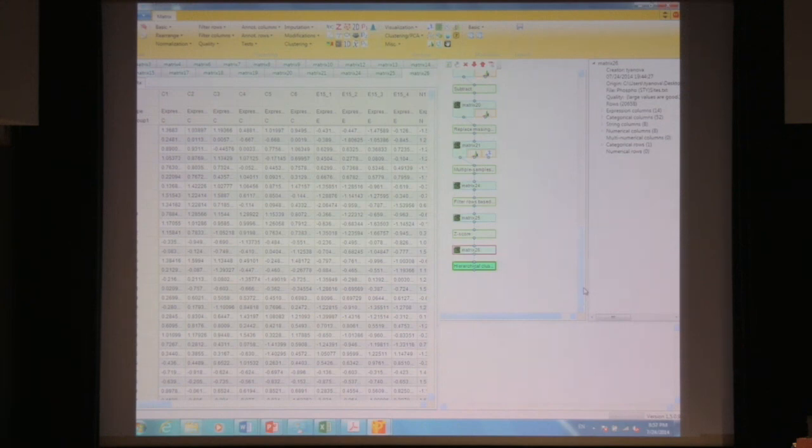So what that basically means is that you bring everything between, for example, -1 and plus 1. So if something's going up by 10 orders of magnitude, it now looks the same as something going up 2 orders of magnitude. That's important for displaying on a tool like the heat map, because now you can see the red and the green more distinctly.